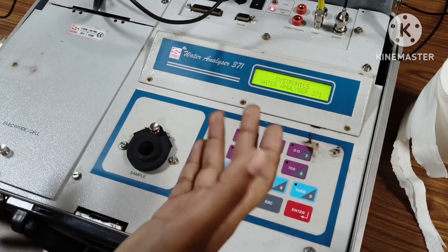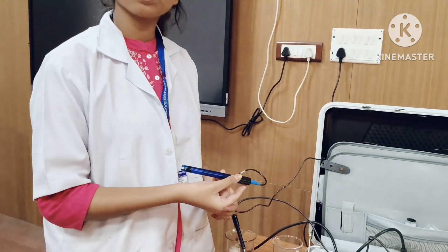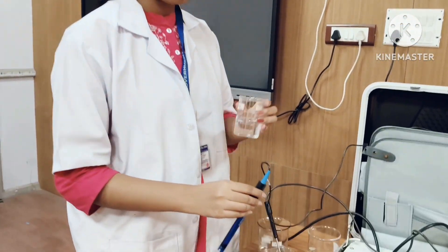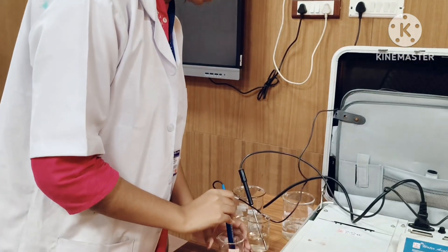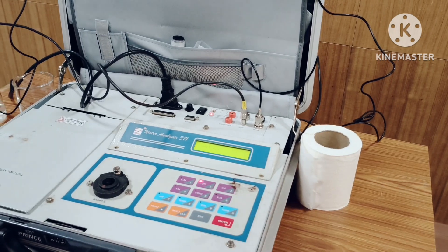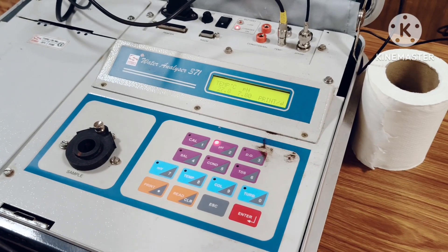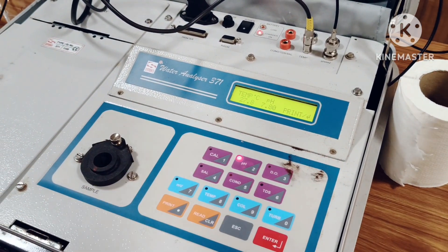The calibration is now done. Since calibration is finally over, it's time to measure the pH of different water samples. The electrode was previously washed with distilled water to prevent any interference with readings. Our first water sample is pond water — we dip the electrode, press pH, then enter, and wait. The reading shows the pH of pond water is 7.8 at a temperature of 27.8 degrees Celsius.